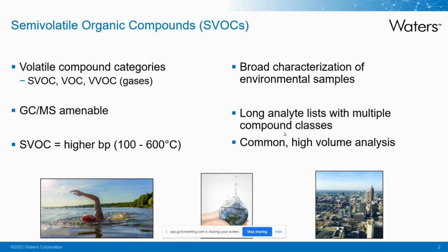So when we talk about semi-volatile, these are not compounds that in layman's terms would be described as volatile at all. But when we introduce them into the hot injection port of a GC and force them through the capillary column with some helium or other carrier gas, then they become volatile enough and amenable to GCMS.